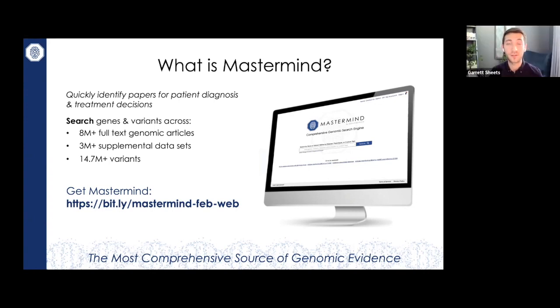Thank you both for being here to talk about some common questions that come up from our customers. We're going to have both Britt and Diane get us started with just some general concepts to get you comfortable with the Mastermind interface, and then we're going to jump into some search examples. So let's get started.